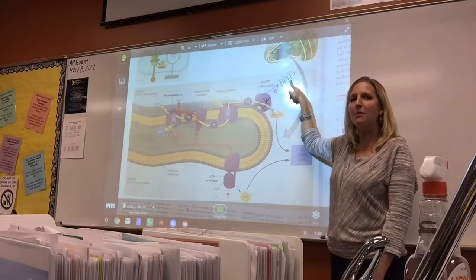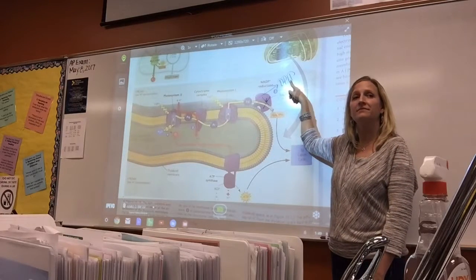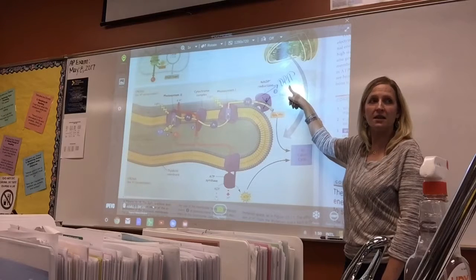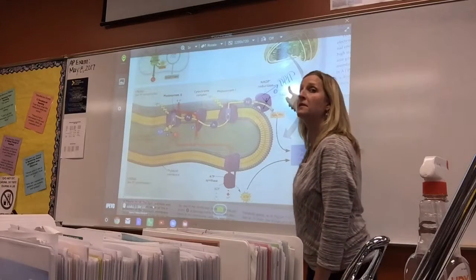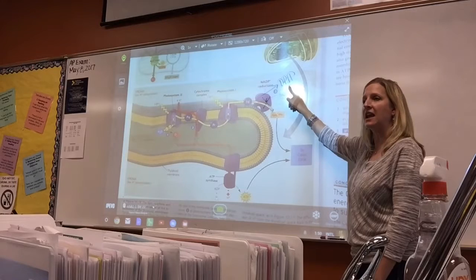electrons, what happens to it? So if this is happening, this DPIP gets the electrons, what happens to it? Spencer? It's reduced. And how would we know? Something physically happens to this.